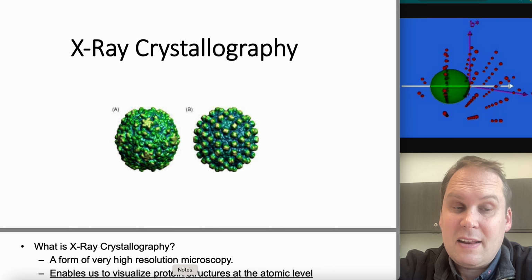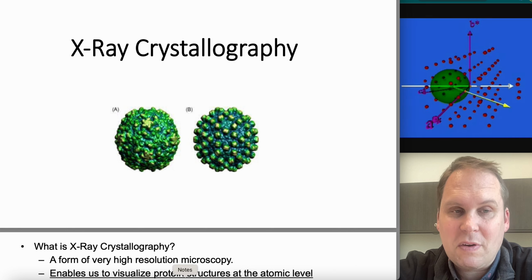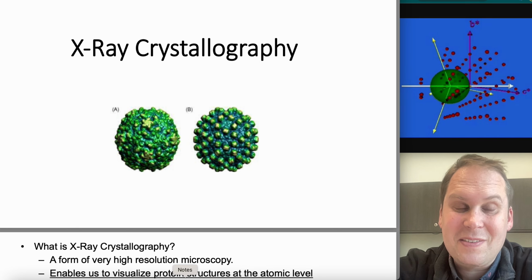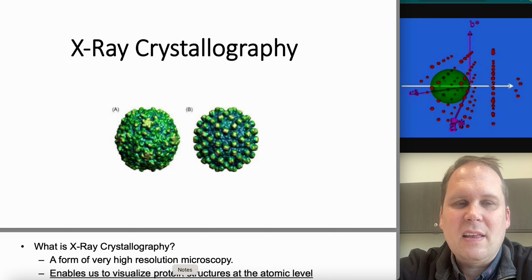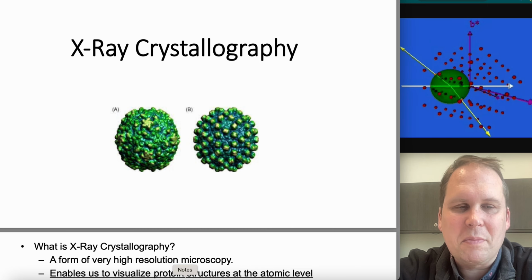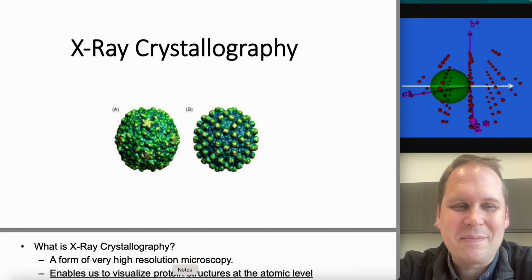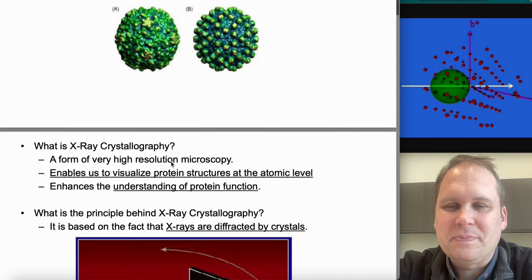And then a lot of the recent structures, and probably the fastest growing field, is cryo-electron microscopy, to reconstruct it, which is basically taking a picture, stacking thousands of those pictures up together, and then making a go of it. I'll show you X-ray crystallography and cryo-EM reconstruction, which is something I'm more familiar with here. There are other techniques that exist, and that's fine. We can't cover everything. So, without further ado, X-ray crystallography.